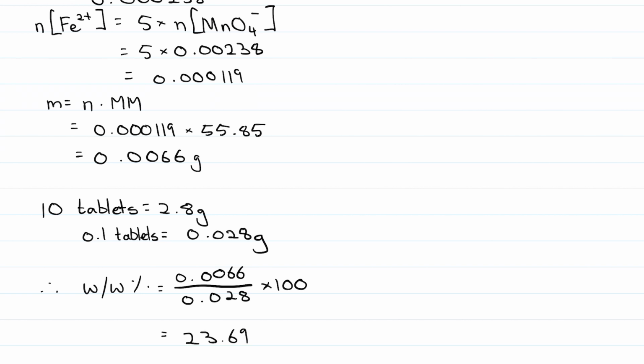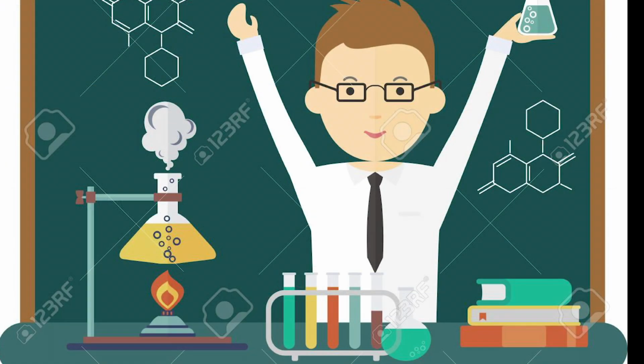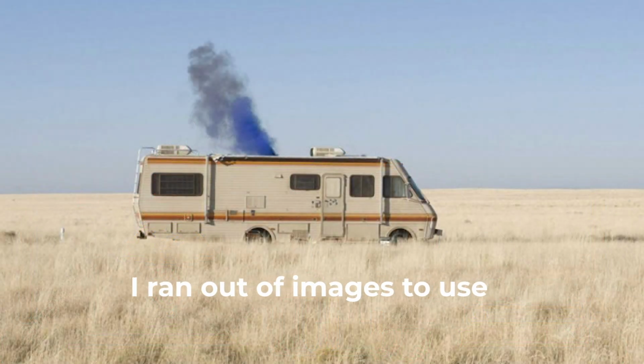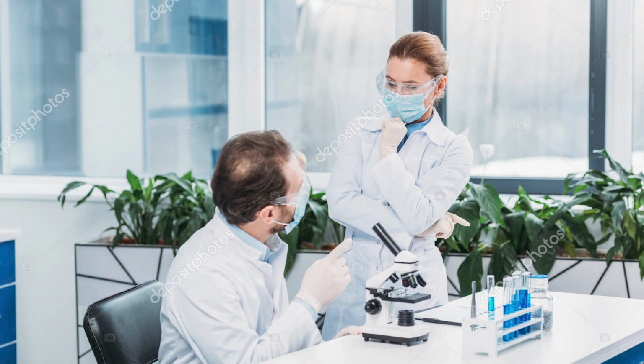For my other brand of tablet, I ended up getting the exact same result, which was not far off the mark either. Now for a first attempt, the results are actually quite impressive, as they got near the mark, being off by only 6.31%. The investigation was designed to be valid and reliable as it actually measures the correct value, which is the amount of iron in a tablet as stated by the inquiry question, and is reliable because it was repeated a total of 4 times.